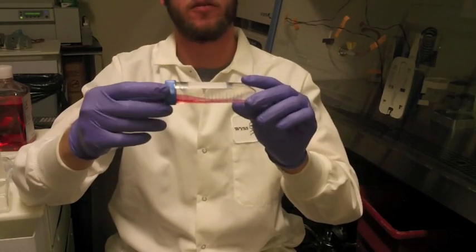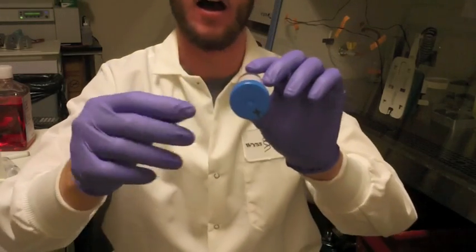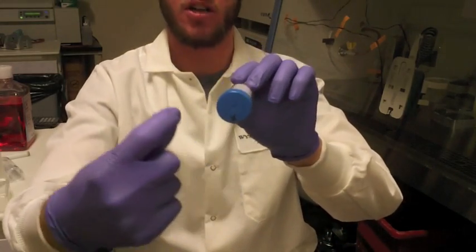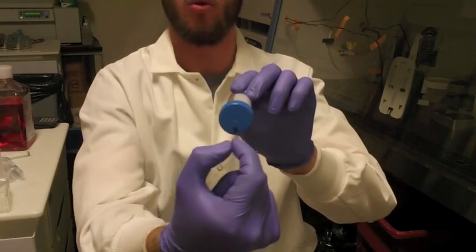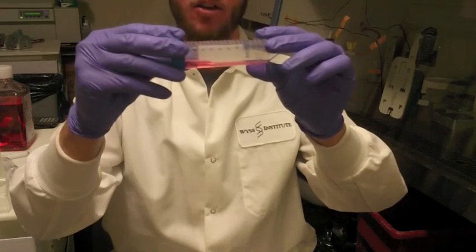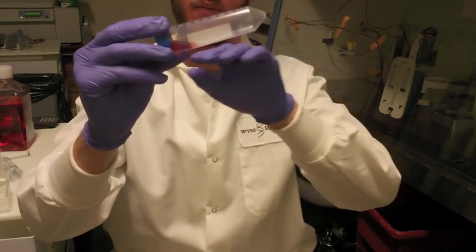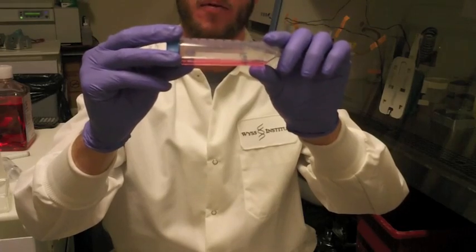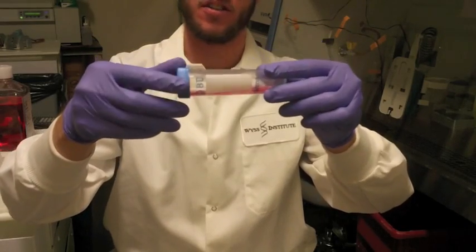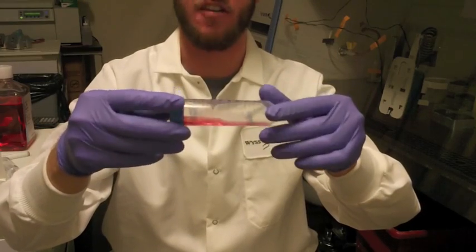The next step is to refresh the media. So a valve located on the end, every time it comes into contact once per cycle with tubing on the actuator, would vacuum out the old media, leaving the cells still stuck to the bottom, and then dispense new media on top. As long as there's a reservoir of new media, this can continue to keep the cells alive more or less indefinitely.